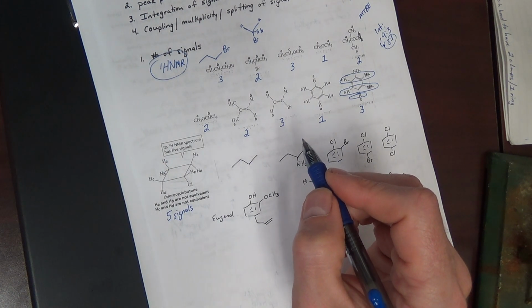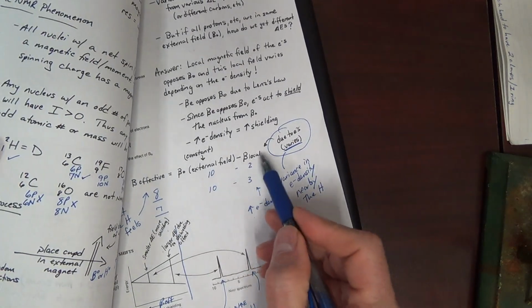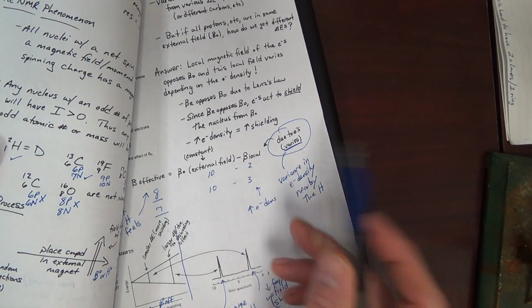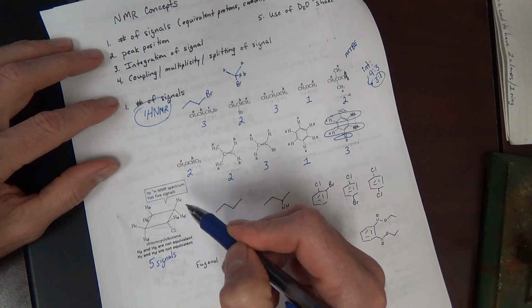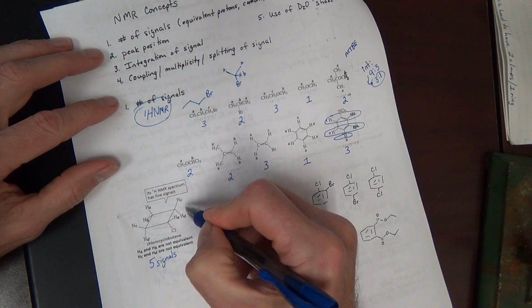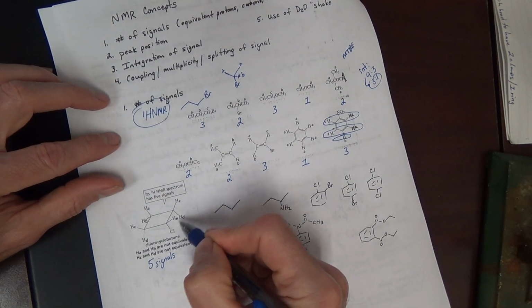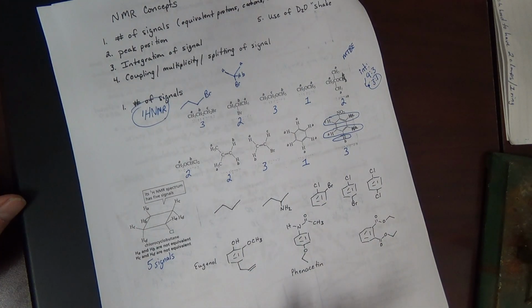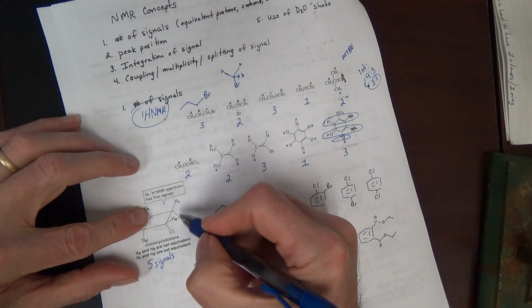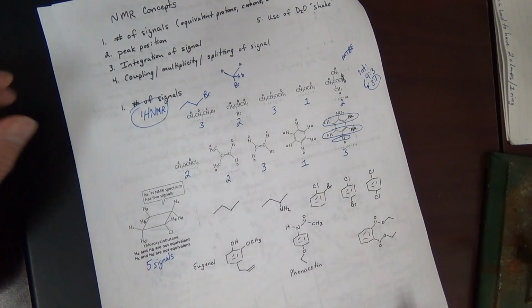Now, electronic effects, which ultimately, this is due to the electrons. This is an electronic effect. The electronic effect occurs through bonds, but it can also occur through space, because the electrons being closer to each other can perturb each other. So ultimately, HD is closer to the chlorine and HC is further away. That's going to lead to a difference in NMR.